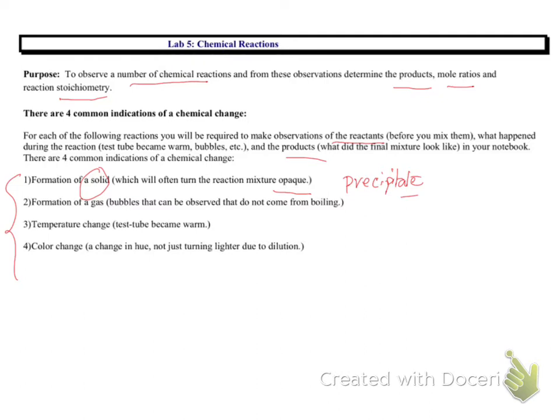If you see the formation of a gas, how do you see that? You see the bubbles. That's an indication of a chemical change.